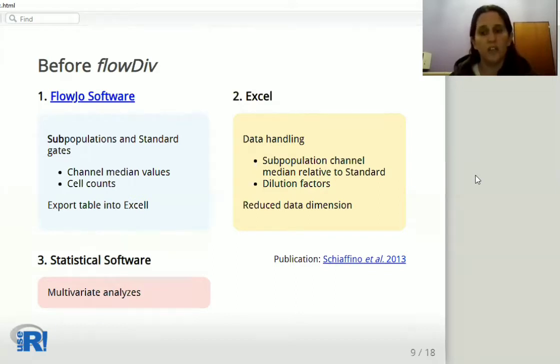We applied dilution factors for each sample. The output had reduced data dimension and was further used for multivariate analysis.